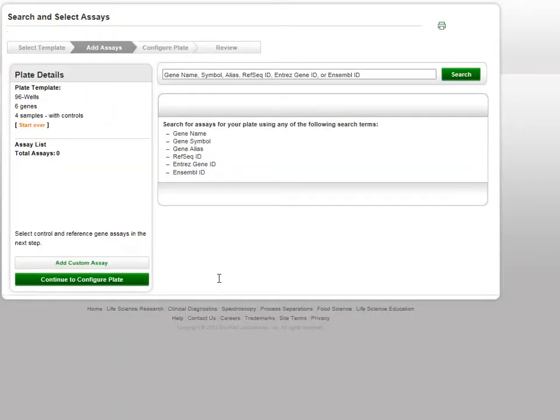If you decide not to use one of the suggested plate templates, you can always select the blank plate template. After selecting the plate template, you will be taken to the Search and Select Assays page.